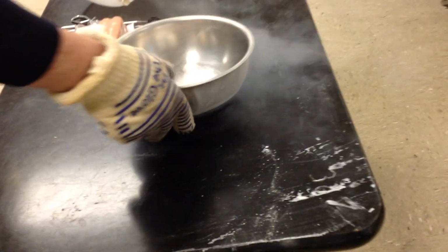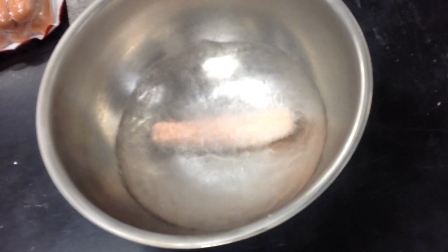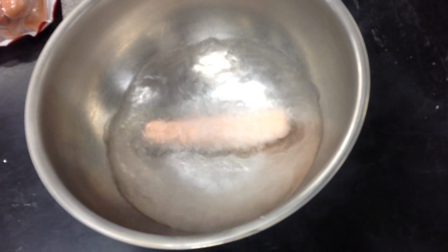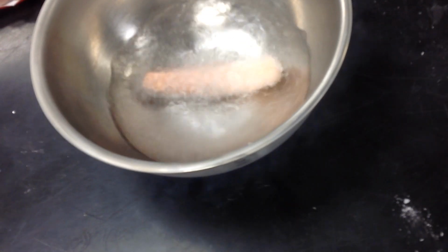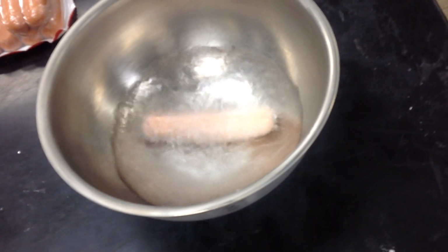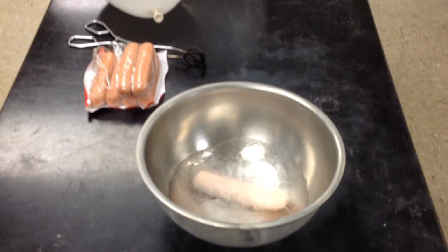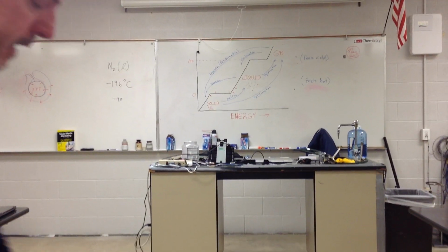You're seeing boiling at minus 196 degrees. Now, I thought boiling had to be hot. Does boiling have to be hot? No. The boiling point of nitrogen is a super cold temperature. We say cold. Cold is a word that was invented by humans based on how we feel. In chemistry, it really doesn't exist. Okay? All right?